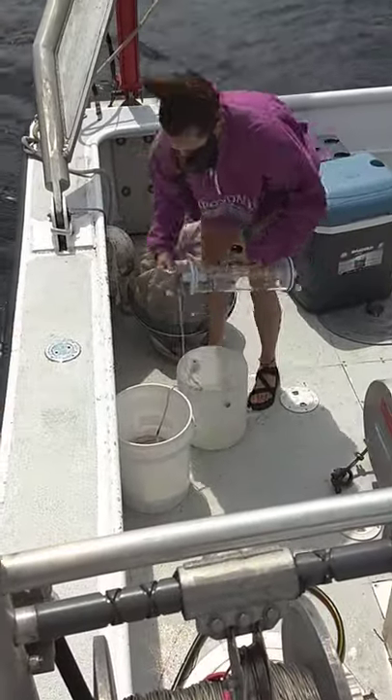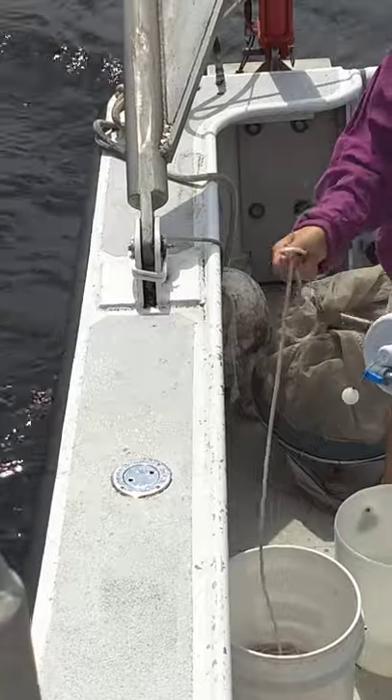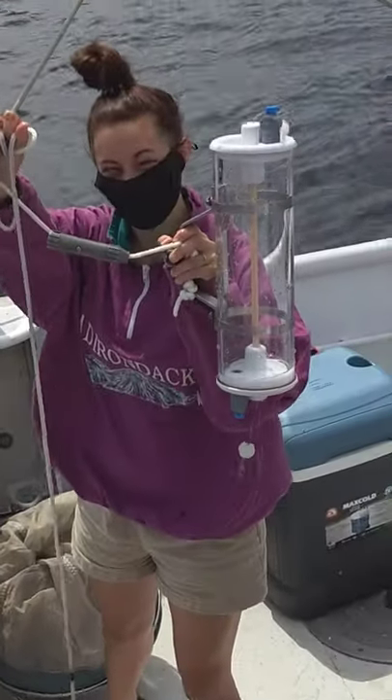Lily, what's that called? What's that called? Hold it up, the bottle. This is the Van Doren. It takes the water quality.